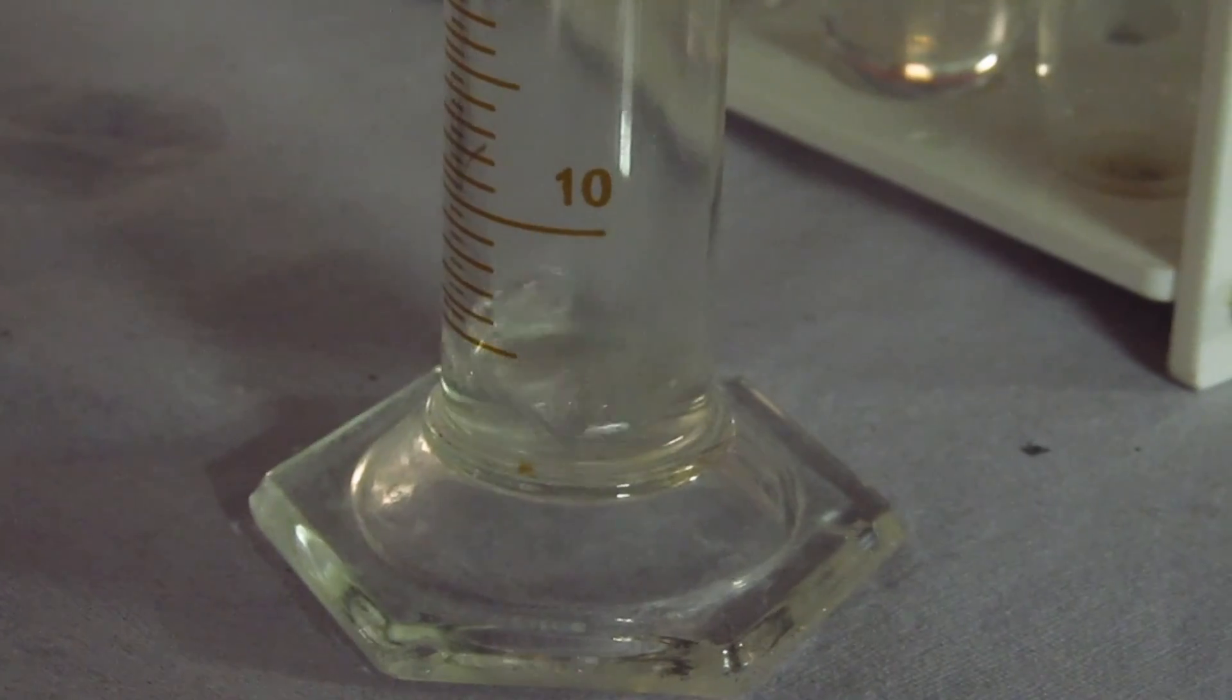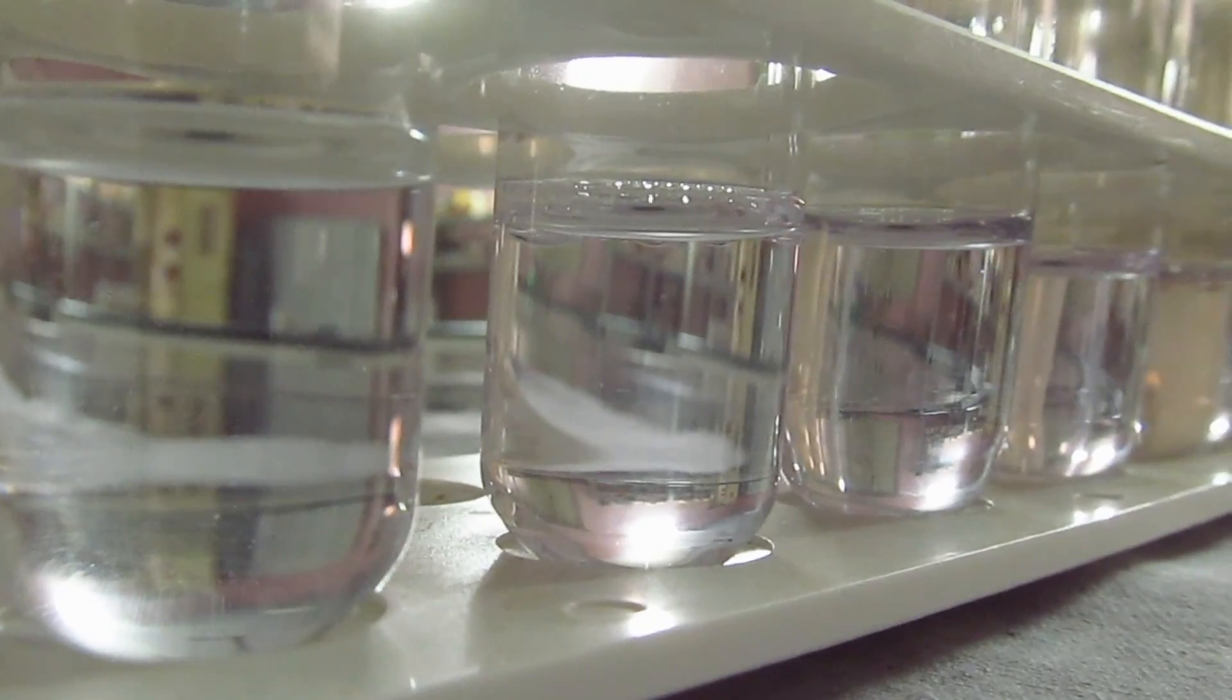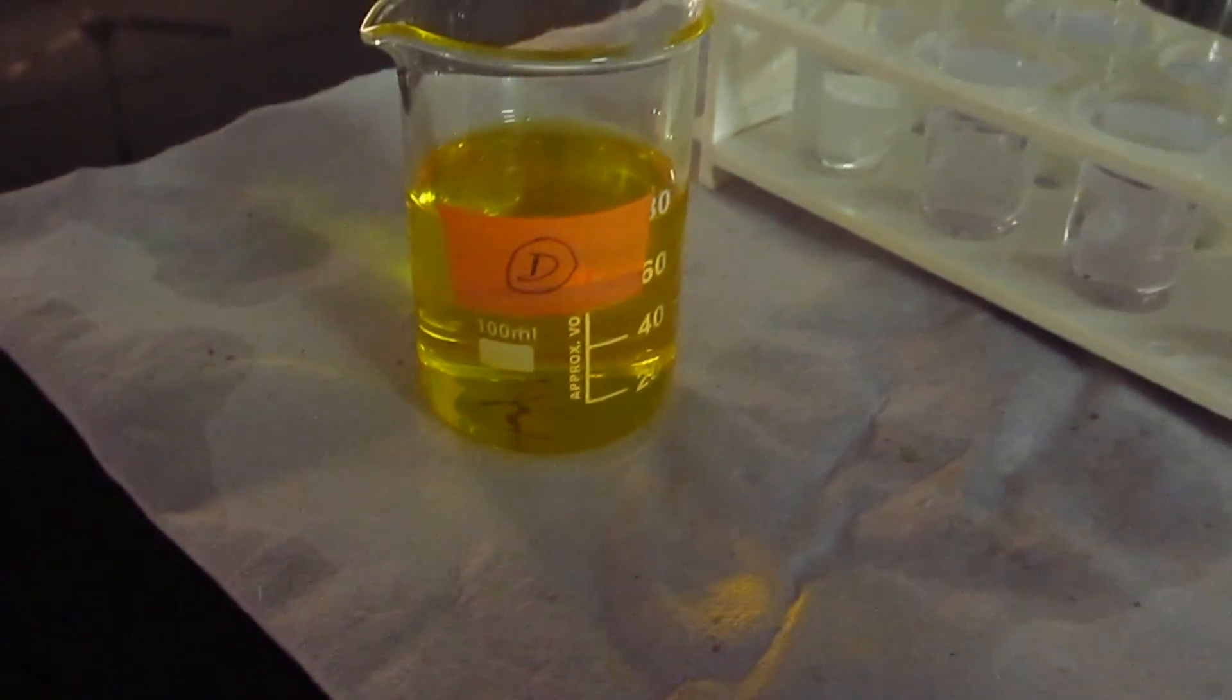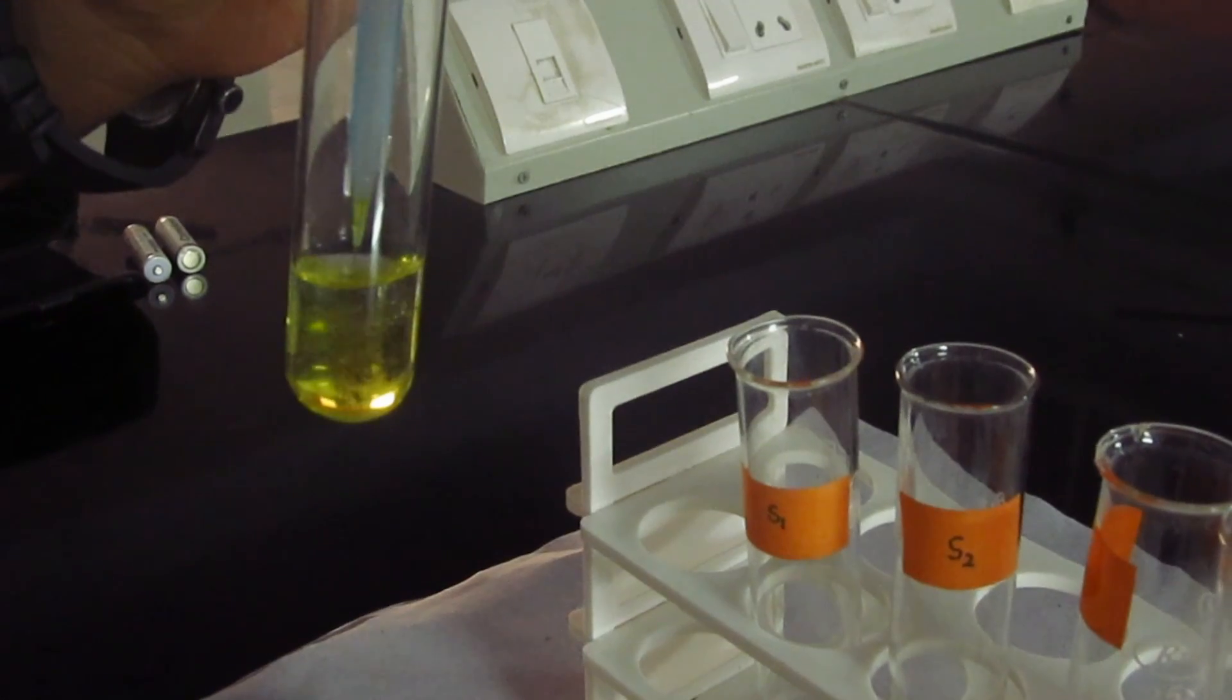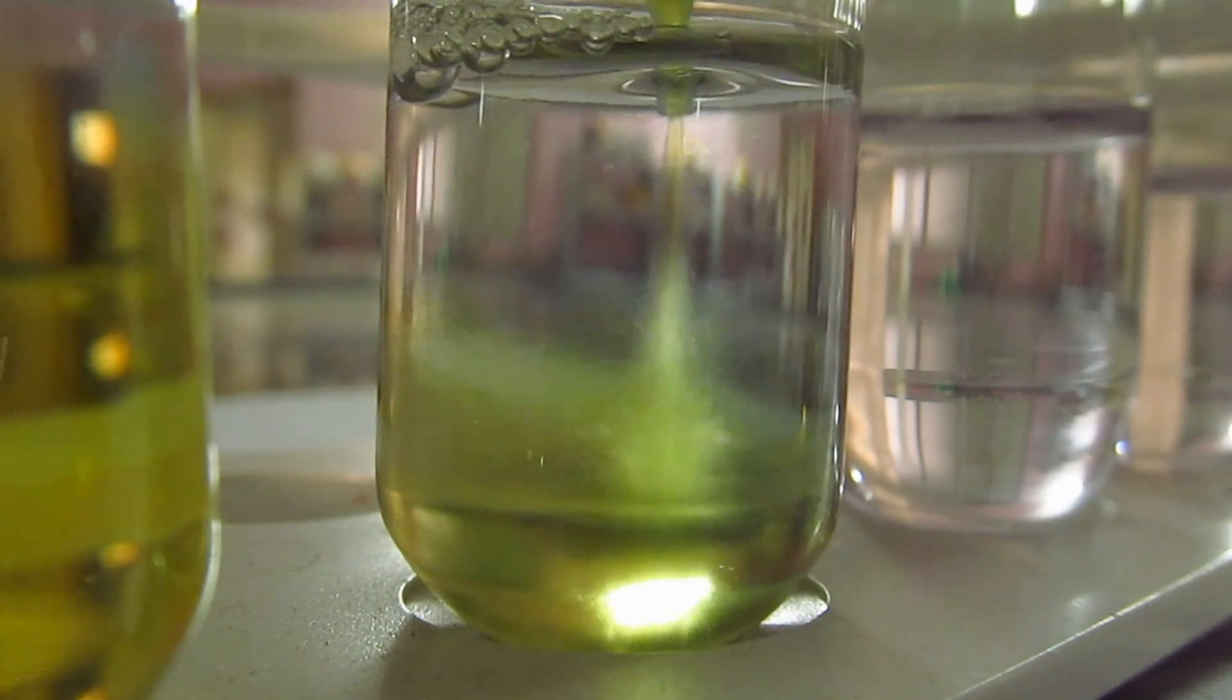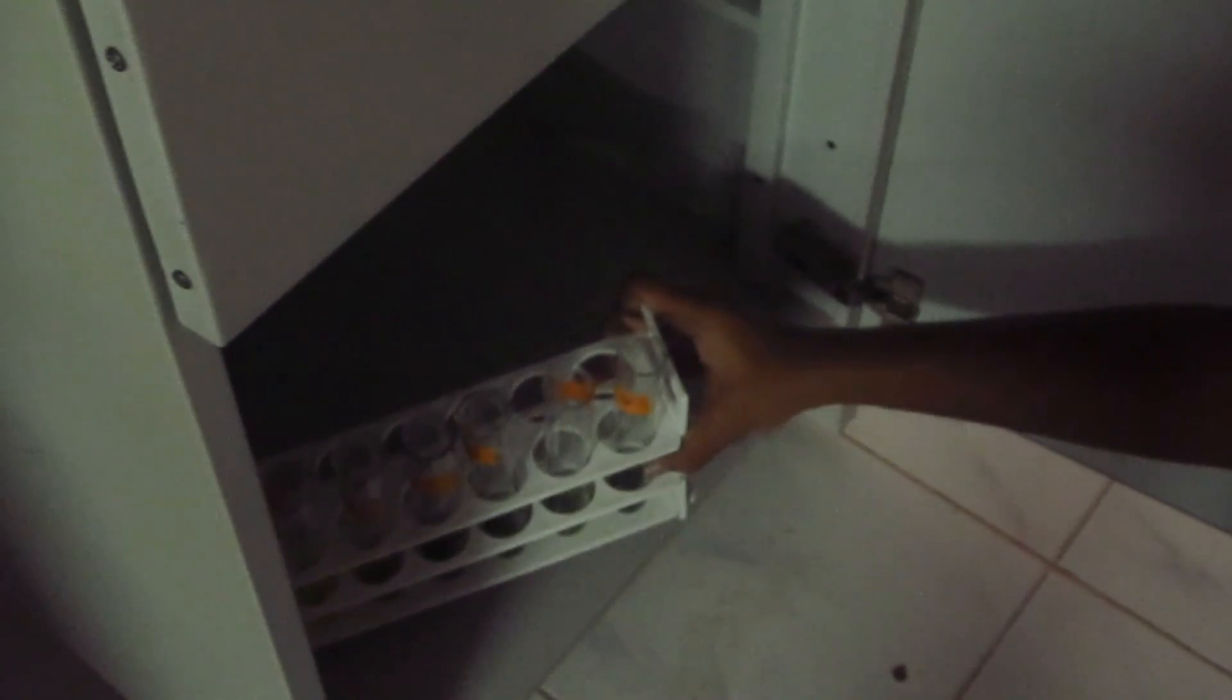Add 5ml of reagent C to all test tubes. After adding reagent C, allow the tubes to stand for 10 minutes. After 10 minutes, add 0.5ml of reagent D to each tube and mix well. After adding reagent D, incubate the tubes in dark for 30 minutes.